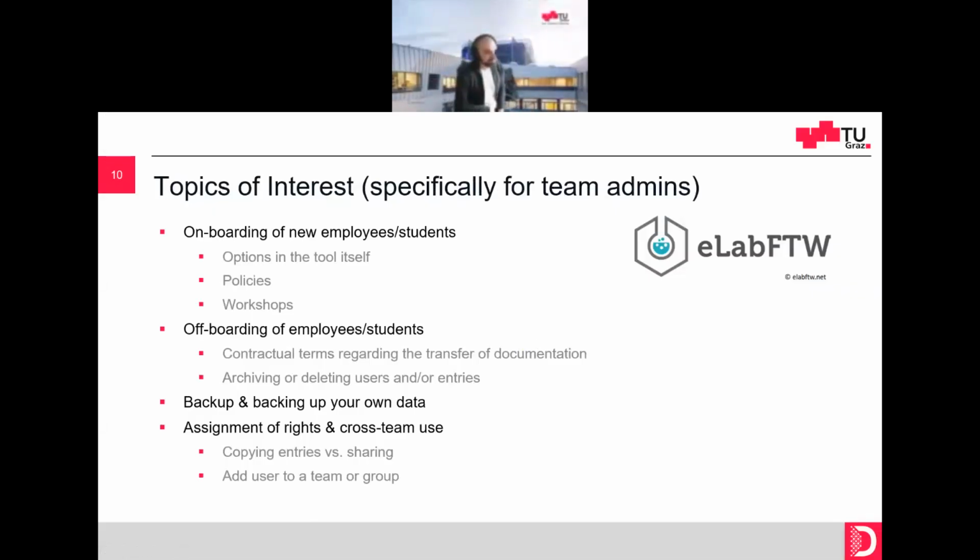There are a few things you have to think about if you want to use the tool, especially if you are team admins, because you have more responsibilities if you are team admin. Onboarding and offboarding of new employees and students are a really important topic when it comes to the use of electronic laboratory notebooks. Even if you handle the printed one, it's always good to give some information on how you want to have the documentation. I think this is true whether it's a paper-based one or a digital one.